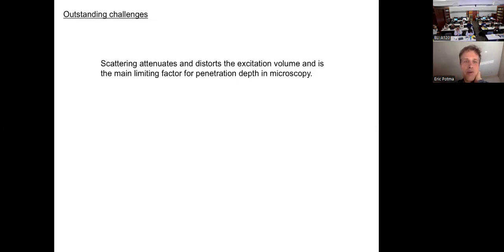Okay, in conclusion, it's time to wrap up. There are some outstanding challenges. I've talked about optical imaging, nonlinear optical imaging, as a great way to learn more about your tissue. We get some molecular information. There are ways to get a little deeper into the tissue. We use 3-photon excitation, right? Those are all examples that we went through.